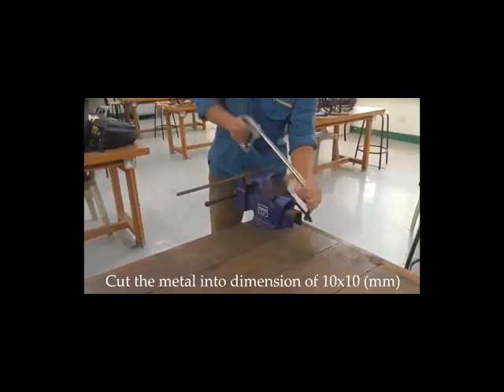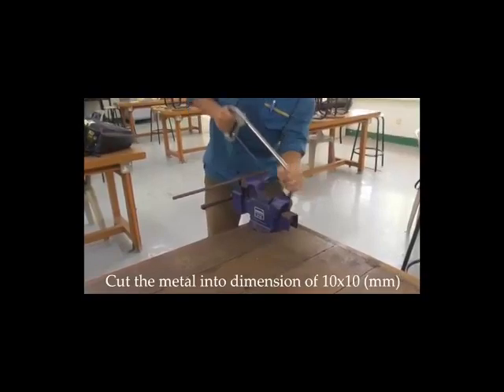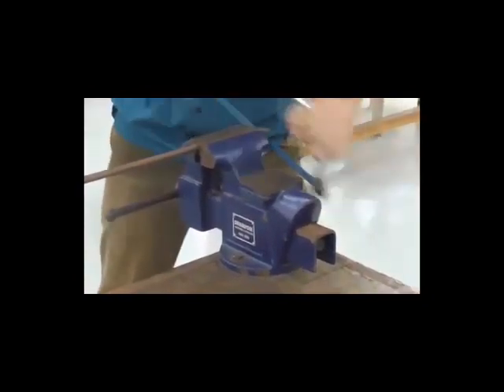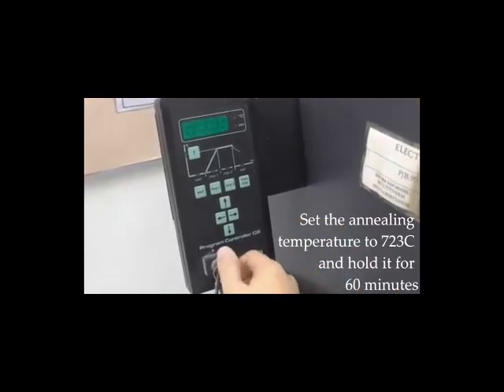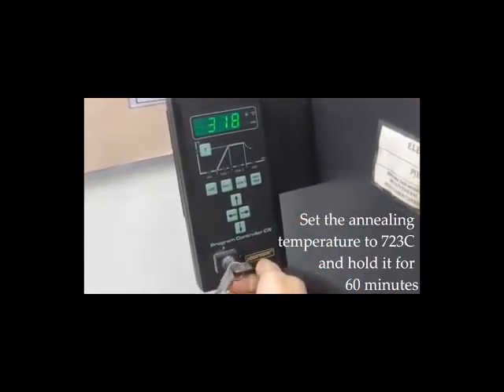Cut the metal into dimensions of 10 by 10. Set the annealing temperature to 723 C and hold it for 60 minutes.